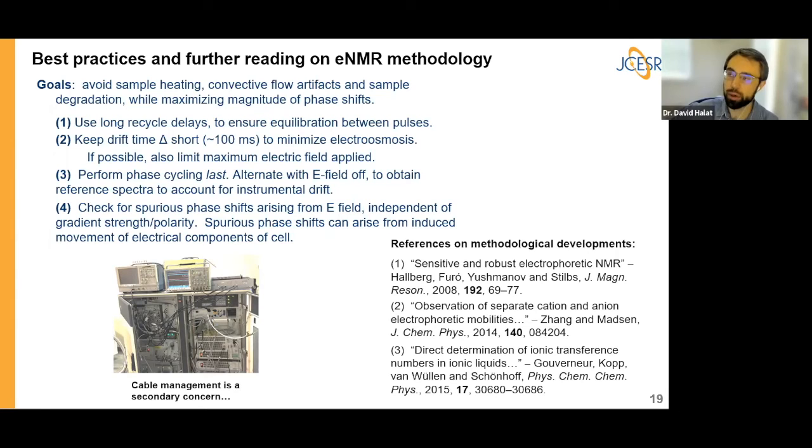Yeah, that's a good point. So there's two different processes. How wide that spread is what's going to cause attenuation, right? So ultimately, you can think about this as a profile of distances, right? And if that profile is very wide, we're going to have a lot of attenuation. But let's say that profile is centered at 0, meaning there's no net migration, well, then the phase shift will be 0. But if that velocity or distance profile is centered at some non-zero value, then it'll either be a positive value, in which case we get a positive phase shift, or it'll be negative, in which case we get a negative phase shift.